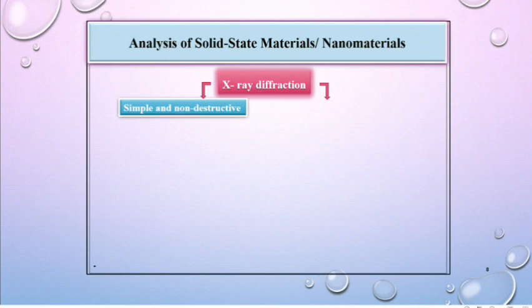Material characterization using X-ray diffraction plays a vital role in all aspects of semiconductor technology, from fundamental research to the manufacturing stage. With the advancement in technology and computer control over the high power X-ray source, diffractometer and counters, this method of analysis has become very popular and is used widely.